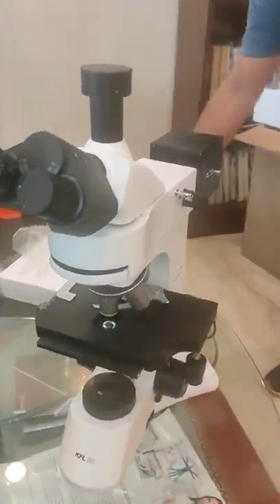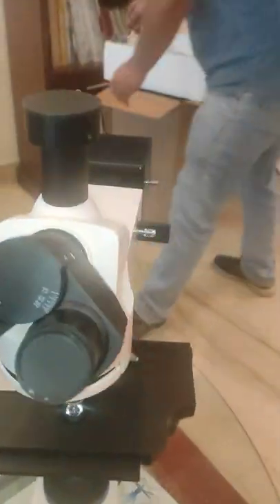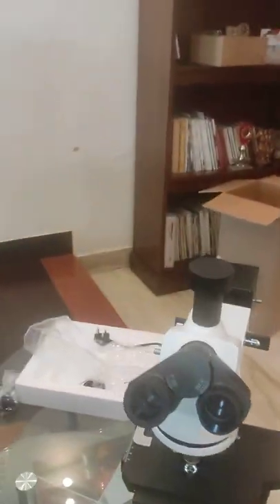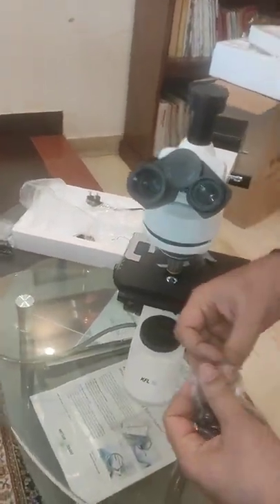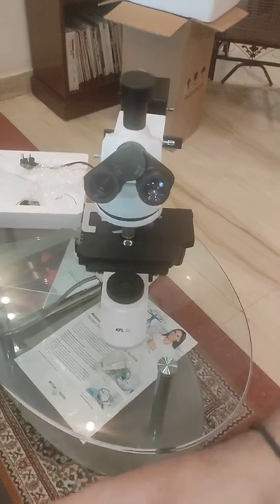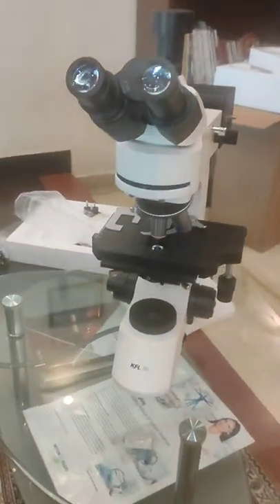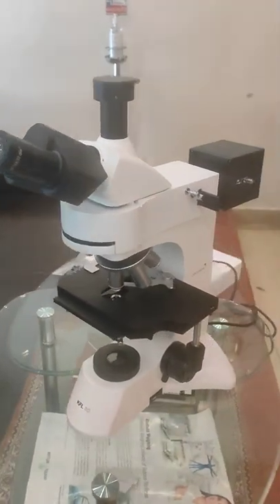So your fluorescence microscope KFL 30 is all set to go. The final stage is to place the eye piece. Thank you. This is all — microscope is all set to operate.